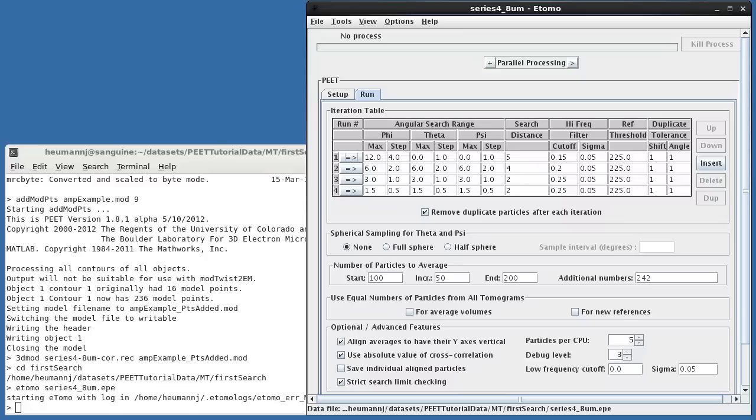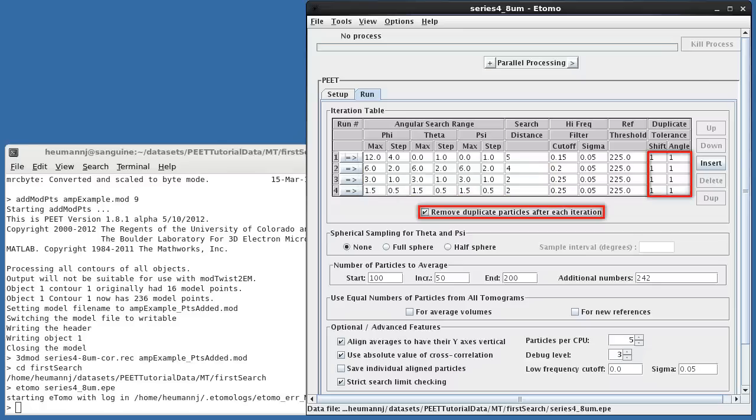At subsequent iterations, I've used the recommended 3 to 1 ratio between max and step for each angle. I've also enabled duplicate removal with thresholds of 1 voxel and 1 degree. Duplicate removal is recommended when using addModPts or when there's a risk of locking onto neighboring points.